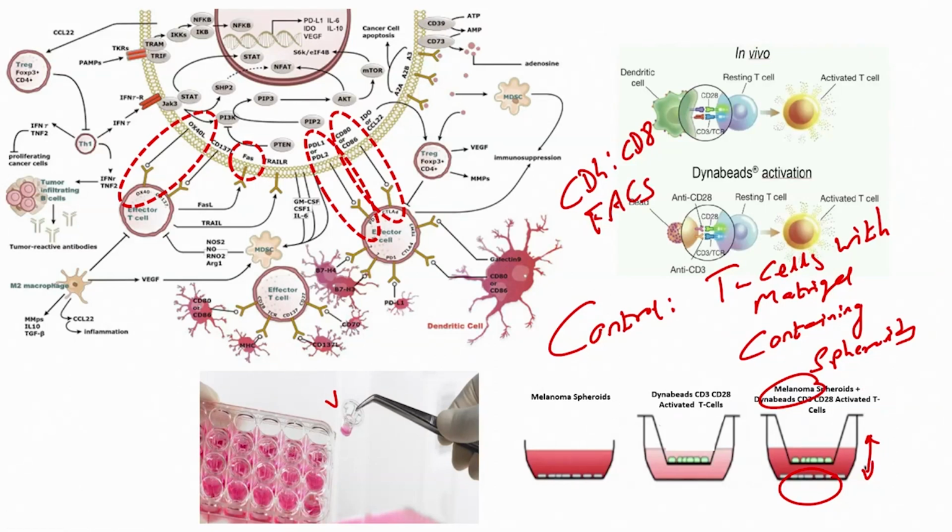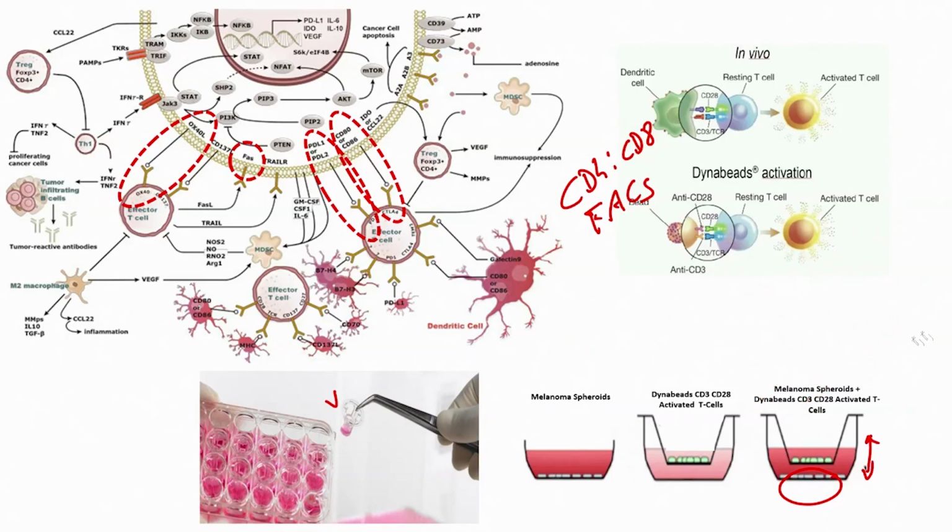Okay. The next step would be you treat these T cells.